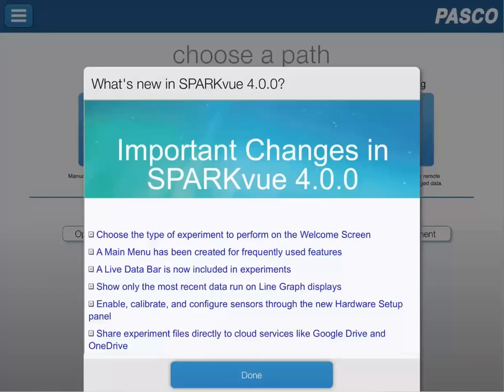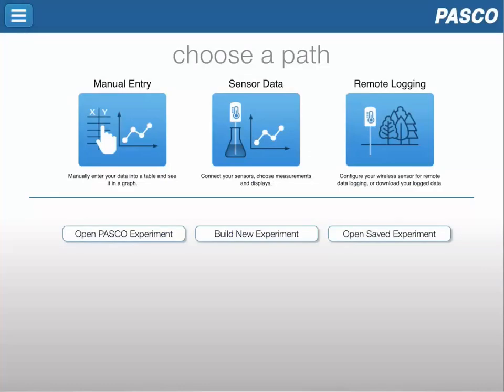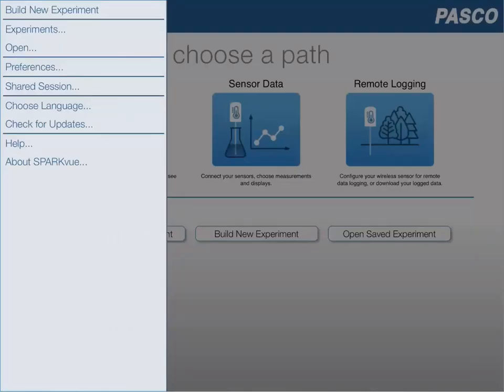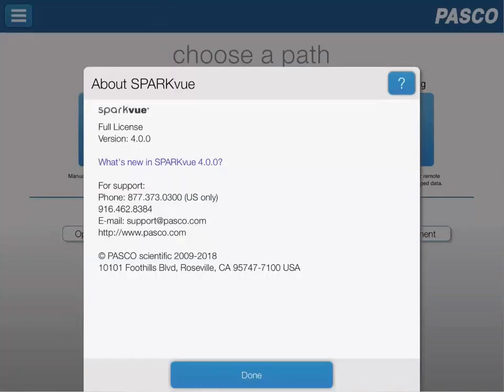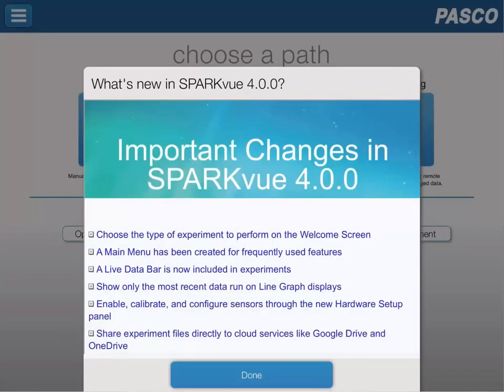Once you're done taking a look at this first splash screen you can click on done. However, if you want to access the menu again, we can select the menu at the upper left hand side, and then from the pull down menu we can select About SparkView. Once we've selected About SparkView, we can then click on what's new in SparkView 4.0 and that will open up the welcome splash screen again.